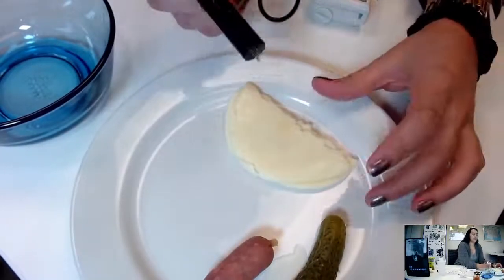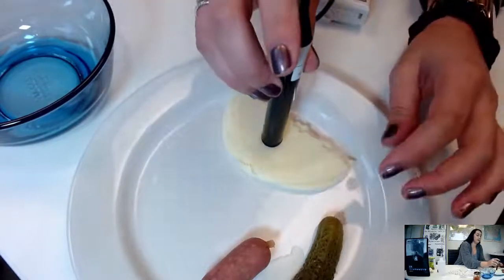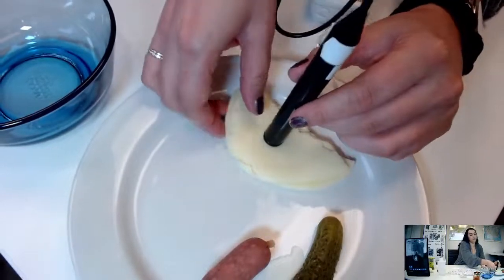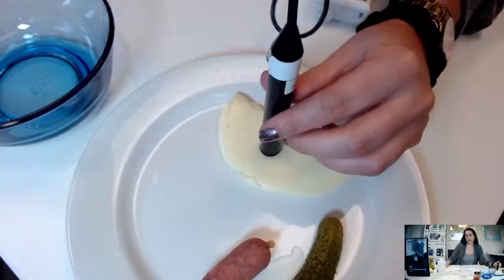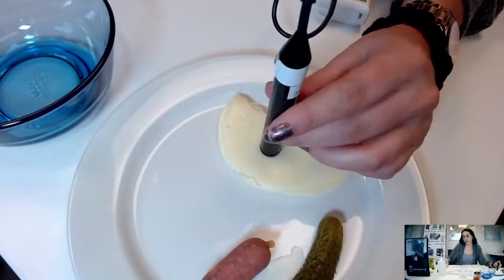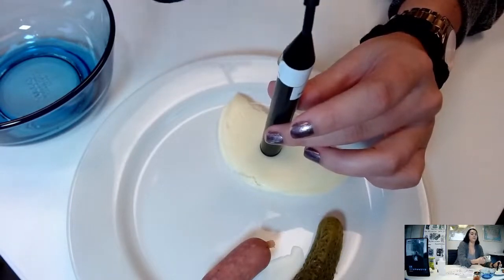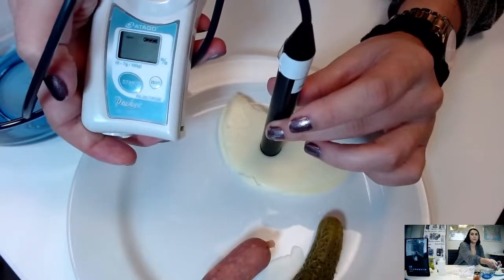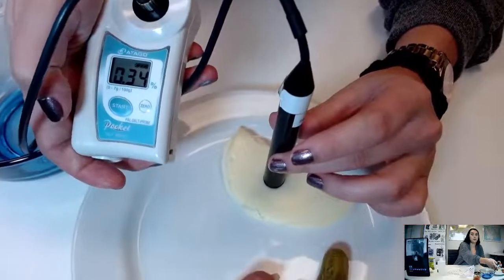Okay. So for this one, we can just gently stick it in like this. And it is going through the entire sample. If you look on the bottom, it's not sticking through at all. So you want to make sure if you are doing something and sticking it directly down, you want to make sure the probes are not getting damaged on the bottom, and that the sample is completely covering those electrode pins. Great. And we'll go ahead and press the start button. Great. 0.34.